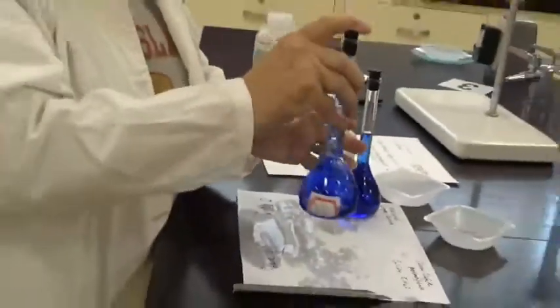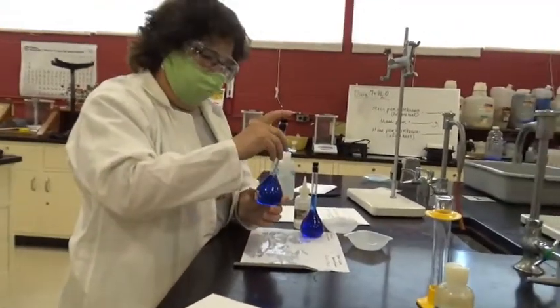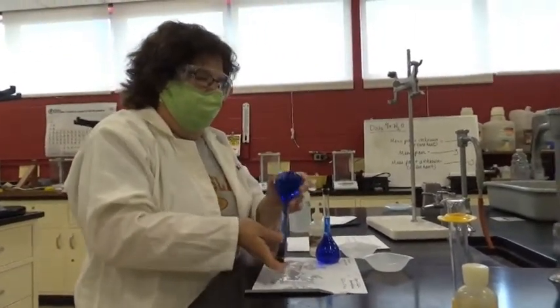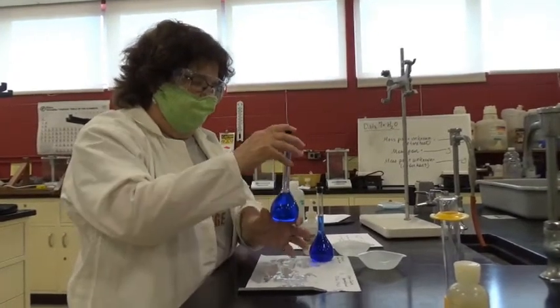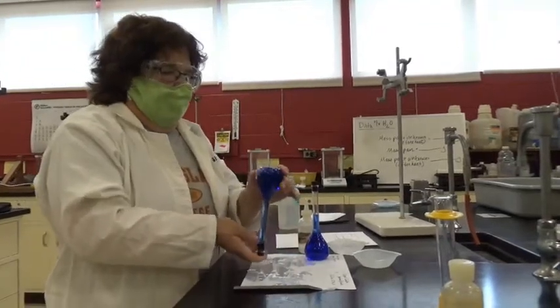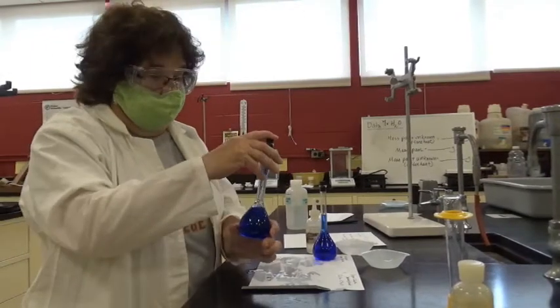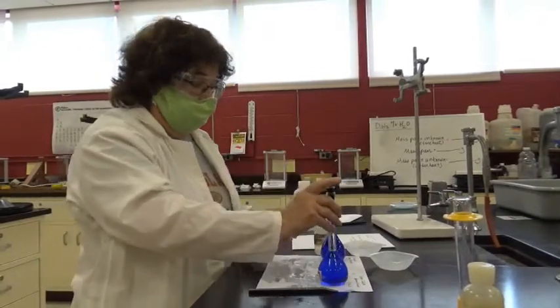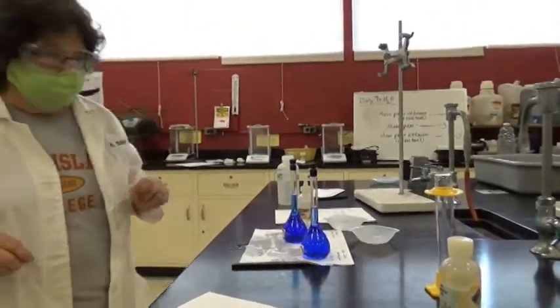again, I'm going to invert it. I see a little bit of solid at the bottom. So we're going to let these sit for a few minutes. Remember, the solid at the bottom will not be reacting, so will not be in solution, so it will throw off your experiment. Now, if we're talking about making errors and how they can affect your results, this is a big one. Number one, maybe all your solid wasn't dissolved. And number two, maybe your solution wasn't exactly right, and that will affect your results.